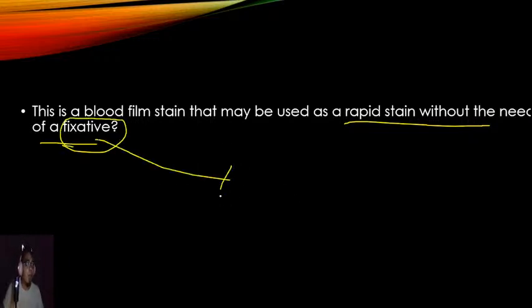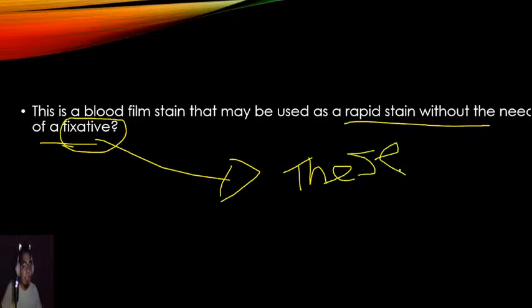Histopathology review for blood film and bone marrow samples or bone marrow aspirates. What is the best? Anybody? This could be asked in your histopathology technique questions or histopathologic techniques. The best.